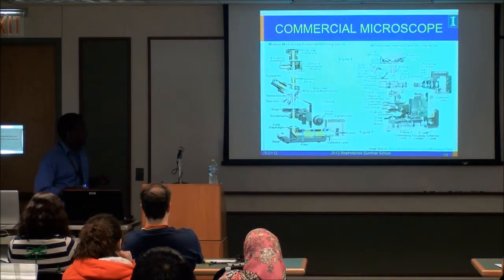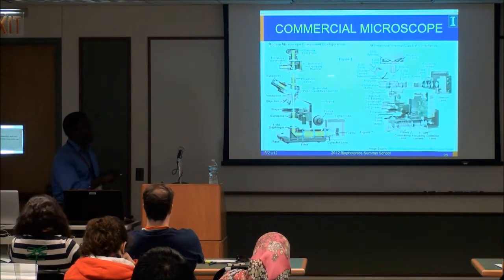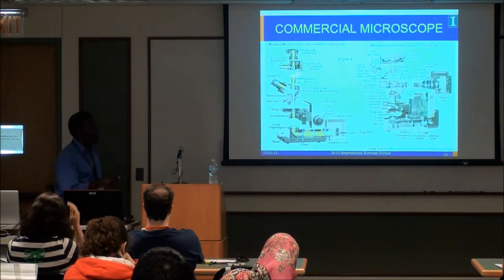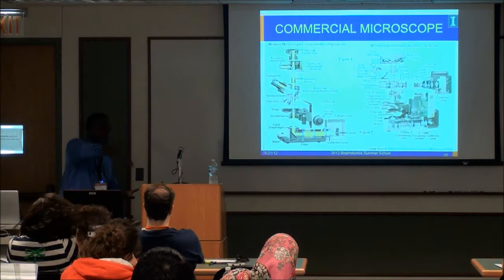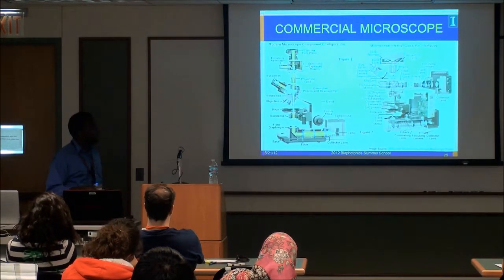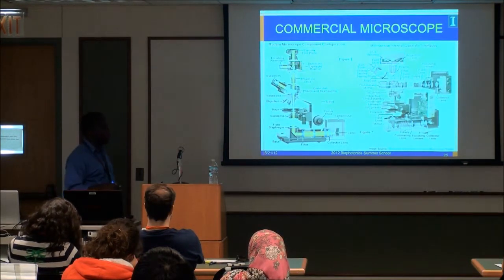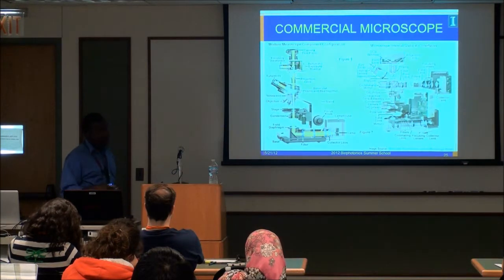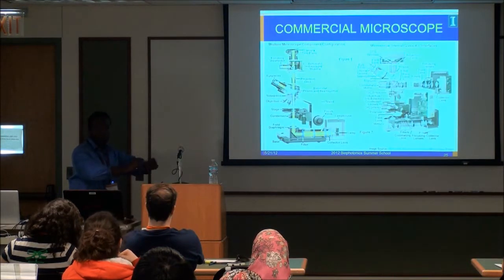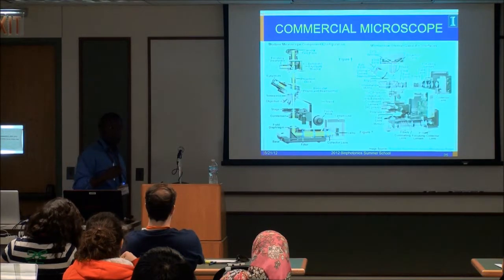By the way, if you want to see the inside of one of these microscopes, you'll see why you pay a lot of money. Someone has to put all this stuff together. Even when you buy some of this, like what we do in my lab, we'll buy two, put one on top of the other, and do some modifications to it. So it's a work of love, but nonetheless, these are fantastic machines. They work very well. They're very different from what I used in junior high and high school, the thing with a simple mirror that flipped up, took the sunlight and brought that up. Oh, am I too old to be the only one here that remembers that?